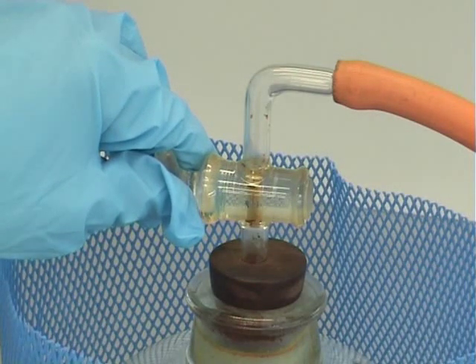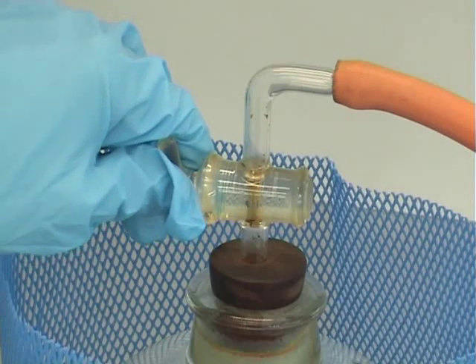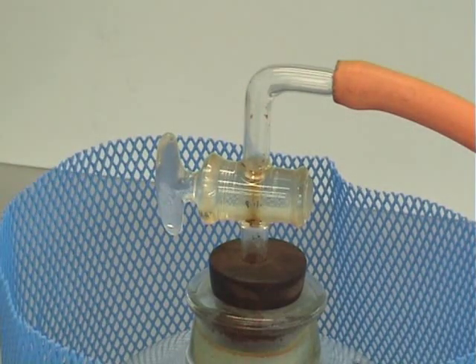Once the hissing stops, you can open the tap all the way. You can then leave the desiccator like this to dry.